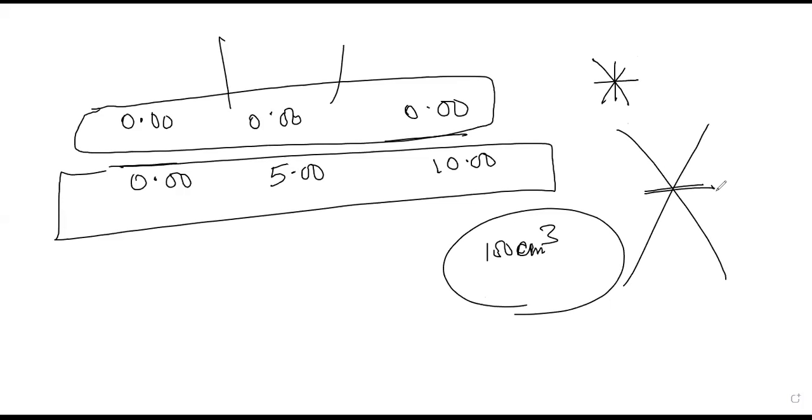Okay, so of course, to get the titre value, as we are told in O level, you subtract. To get the titre value, you get the final burette reading minus the initial burette reading. But you understand me very well. I've said that they can be the same or different.